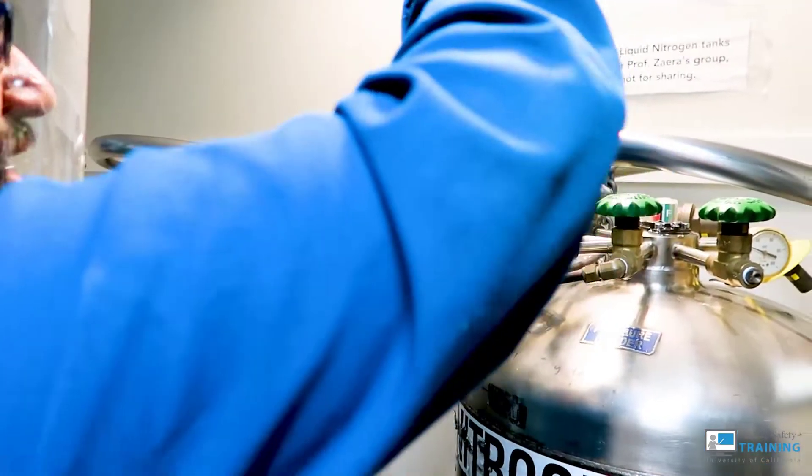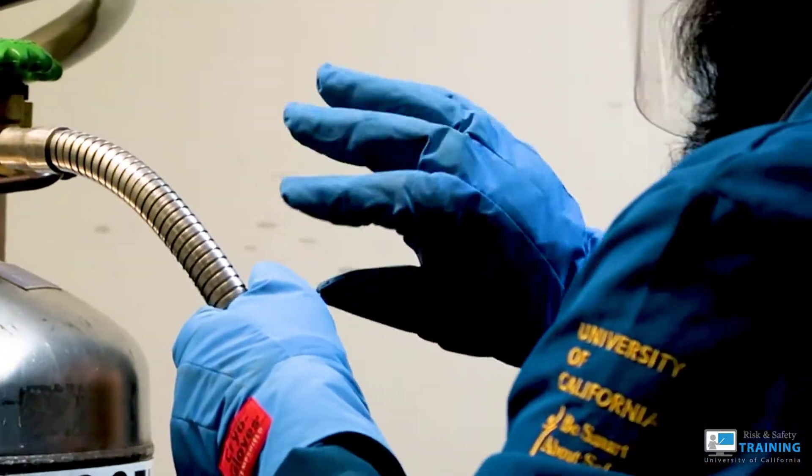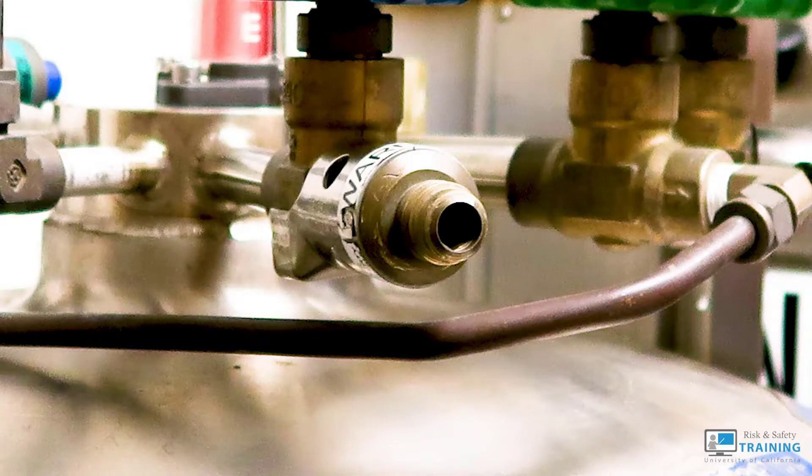Connecting a transfer hose to a cryogen source involves the safe use of equipment to ensure you protect your hands and avoid damaging the threads or outlets.